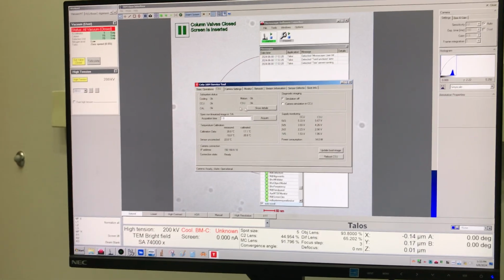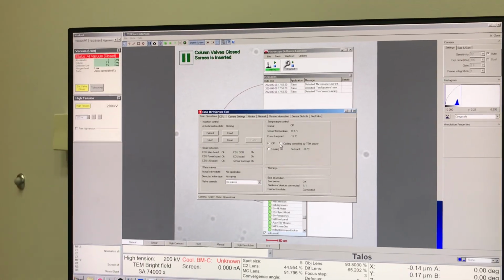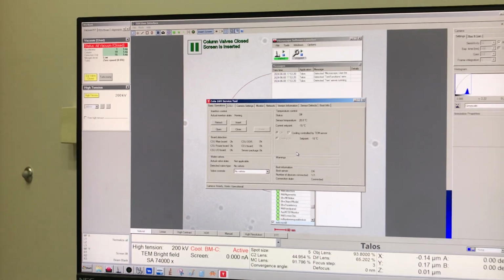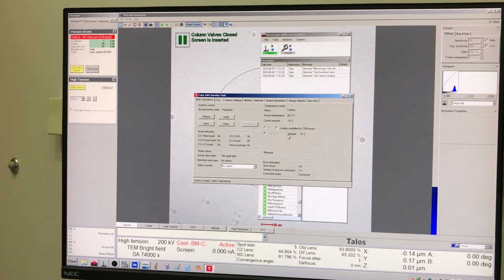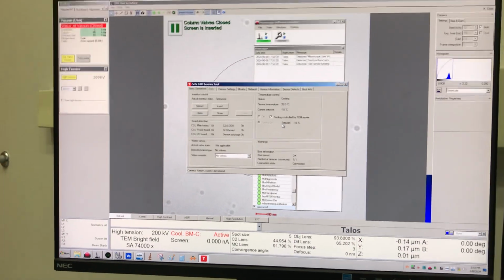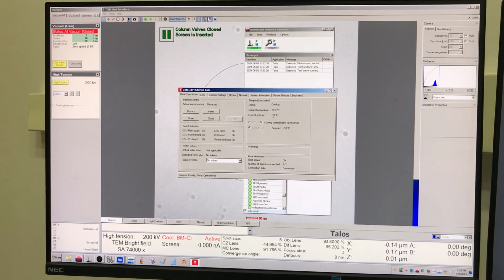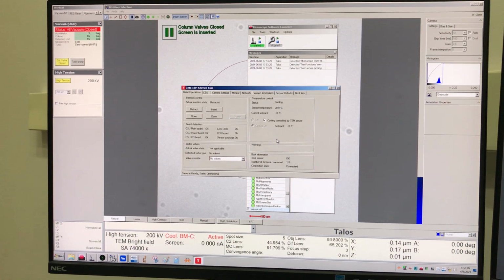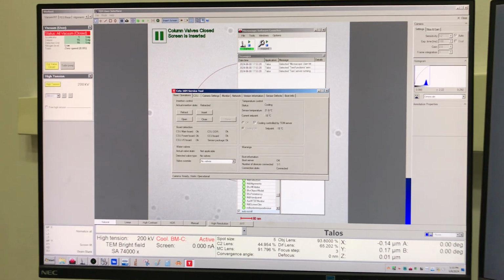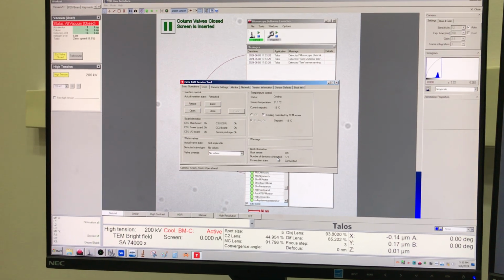So now come back to basic operations, and now you need to check cooling control by TEM server. And then it should say cooling now, and it should start cooling. Now, the cooling on this is not fast. You have to get from room temperature back down to minus 18°C. Since this got that warm pretty quick, it's probably going to take 45 minutes to an hour.